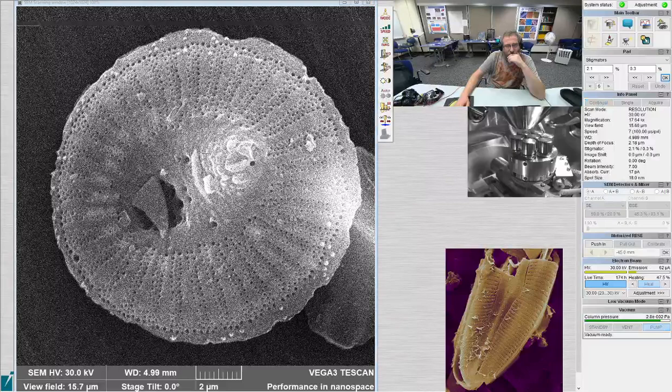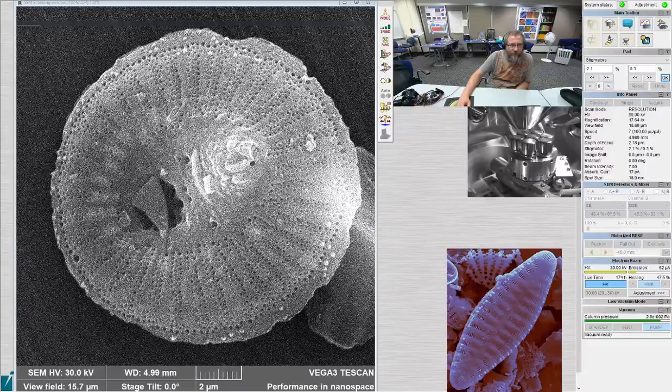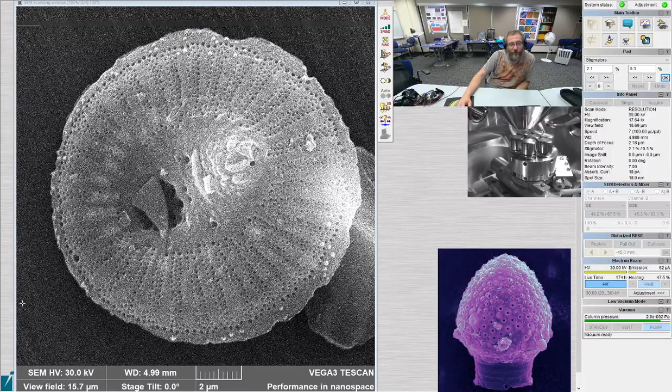I think we've seen this one before. Yeah, it's got a really sharp undulation. I think we're at probably the smaller end of this species. You can see there's the rim of the portula opening. I think it's the same as the one we've been seeing. It's kind of a weirdo, so I thought I would get a picture of it. Yeah, no, it's good. Weirdo is a scientific term.